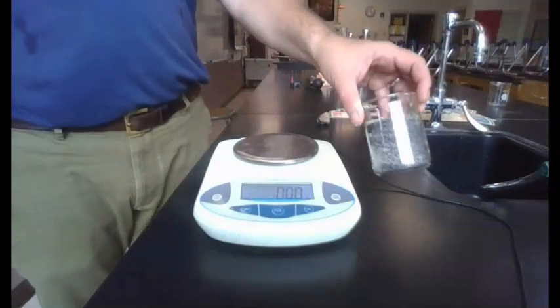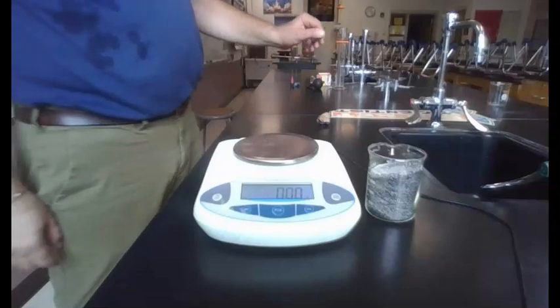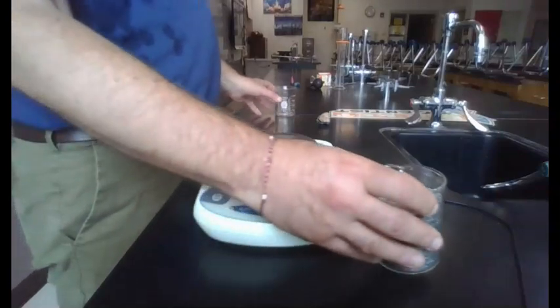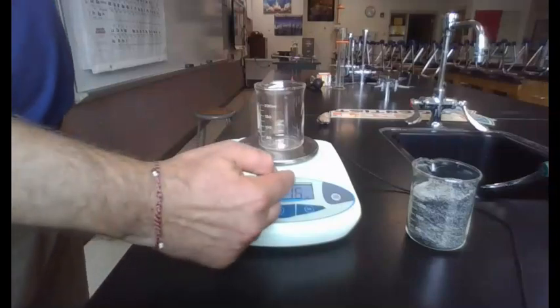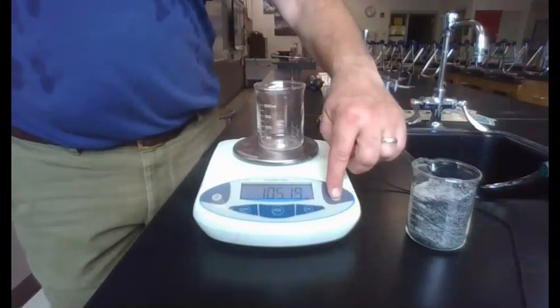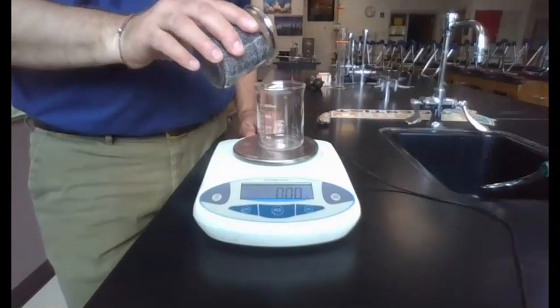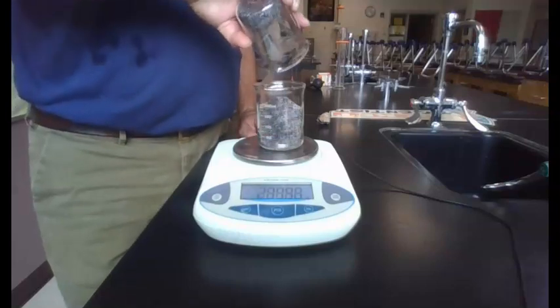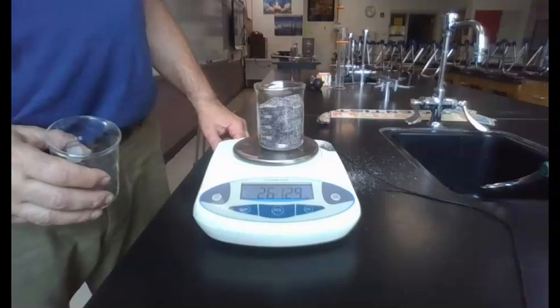So here I have a container of ground up galena. How do I get the mass of the galena without getting the mass of the container? Well, to do that, first what we do is put the container on the scale. And you can see the container weighs 105.15 grams. And then I'm going to hit this button here. It says tare or 0. If I hit that, the scale automatically subtracts that. It says I have 0. And then if I add my material, whoop, I will get a reading.